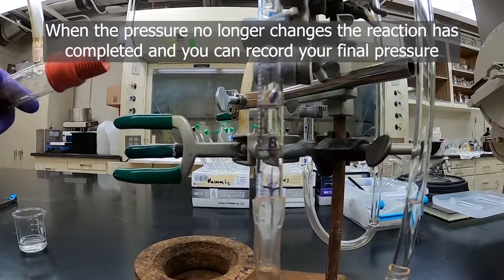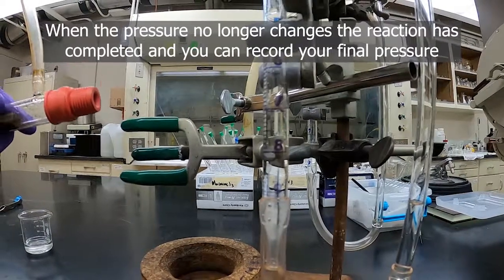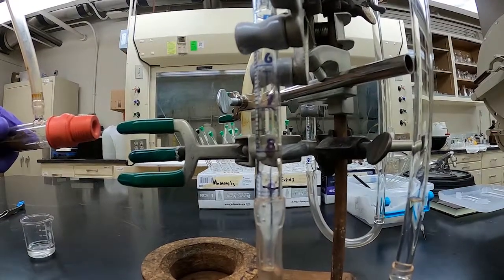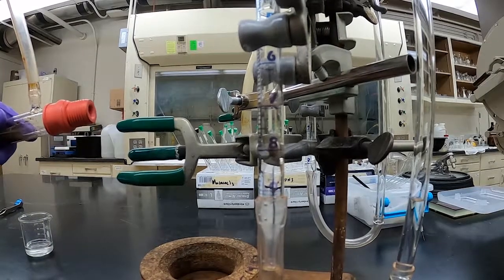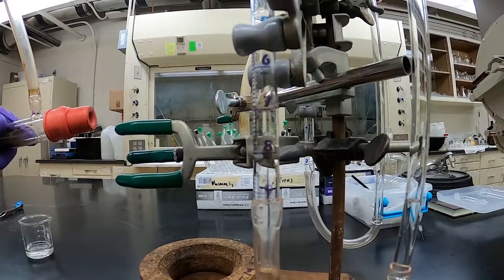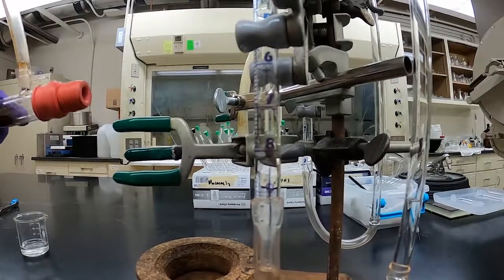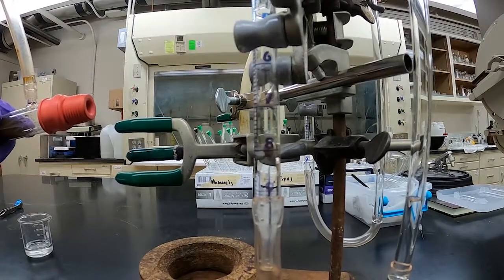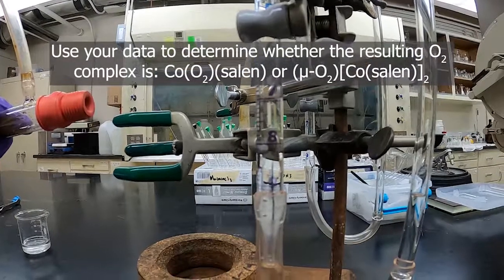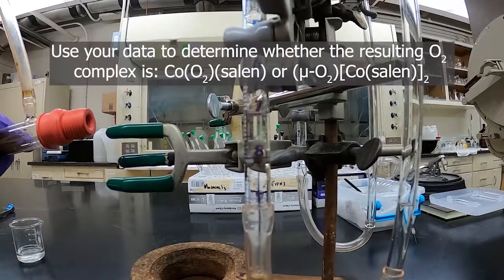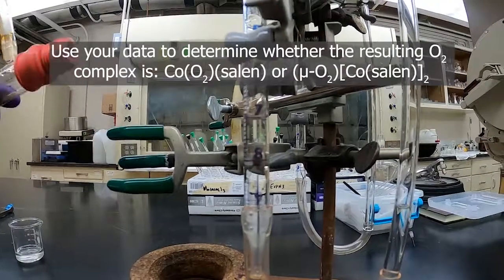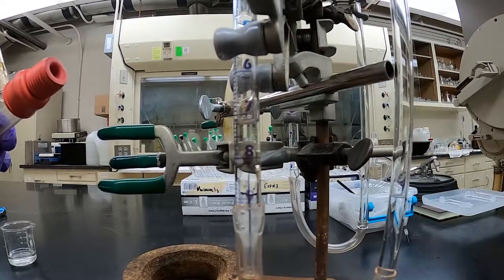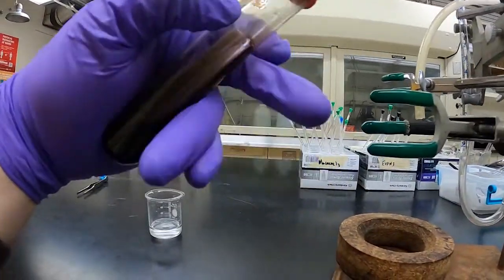So in your experiment, you'll want to shake this and let this sit here until you no longer observe any change. And then you'll use the volume of oxygen that was absorbed to determine some things about the cobalt complex that we've made and how it binds oxygen. And that is the cobalt saline O2 uptake.